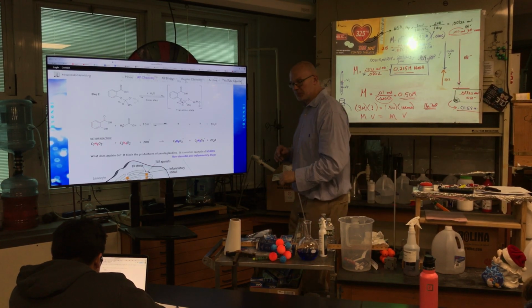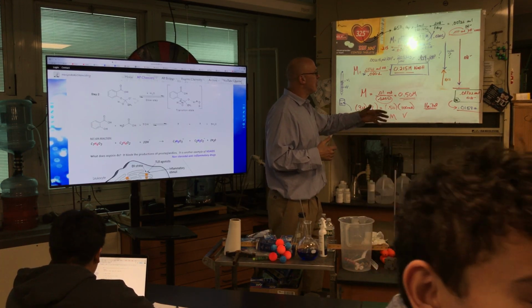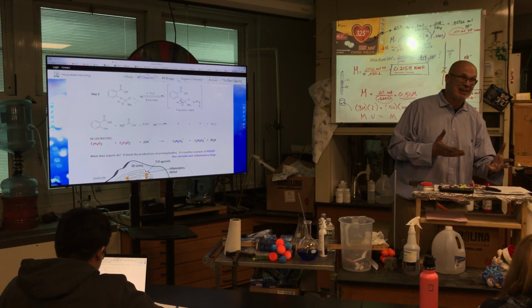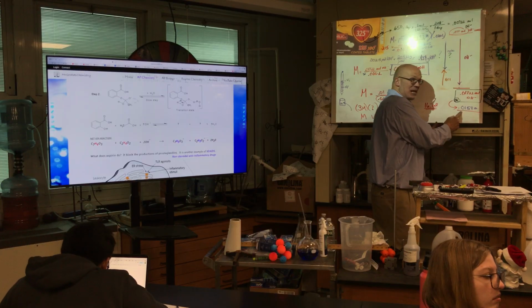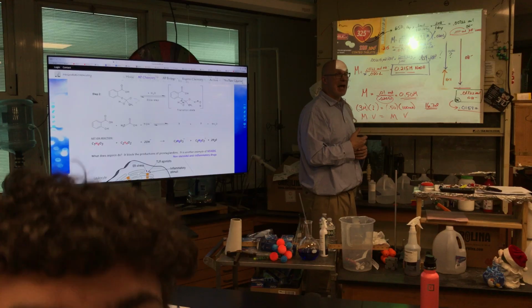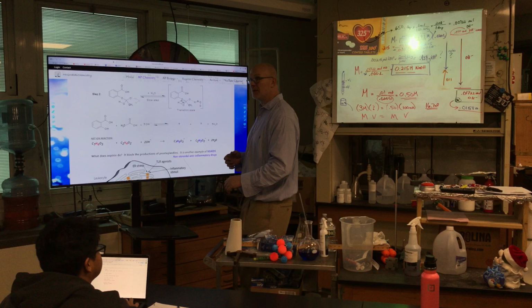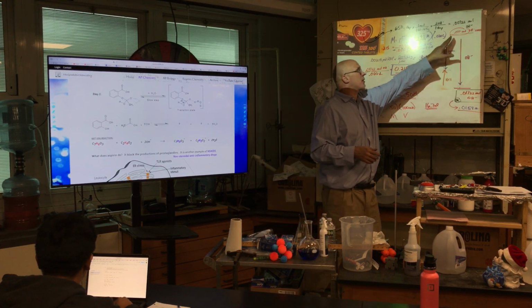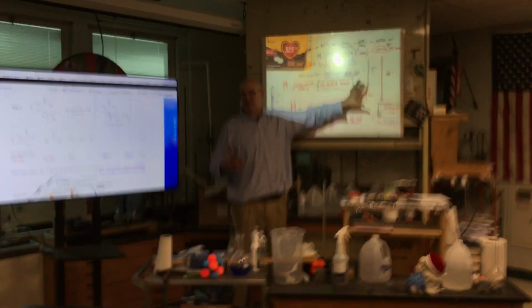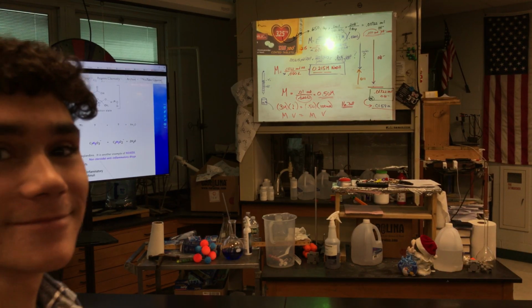Yes? When we standardized it, we got the value of the moles of NaOH without its reaction to other gases in the environment. Yeah, we got to the first arrow by assuming that what we make is what's gonna be, but we know it's not. But we badly need this number. So is that value like the 0.0159 after it reacts, so it's smaller because? Yes, and that's the one we have to use. The 0.01, we could have changed that. Yes, we could have figured that out and maybe made a better one here, but it's not gonna matter because if you need more, you use more. Right, it's a good point. You got it. Tomorrow we're gonna do it.